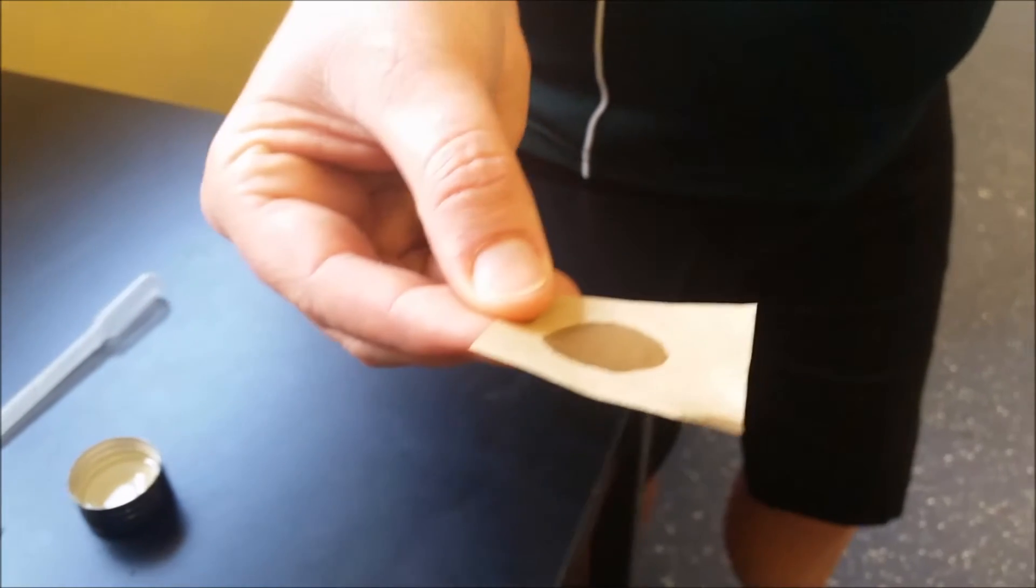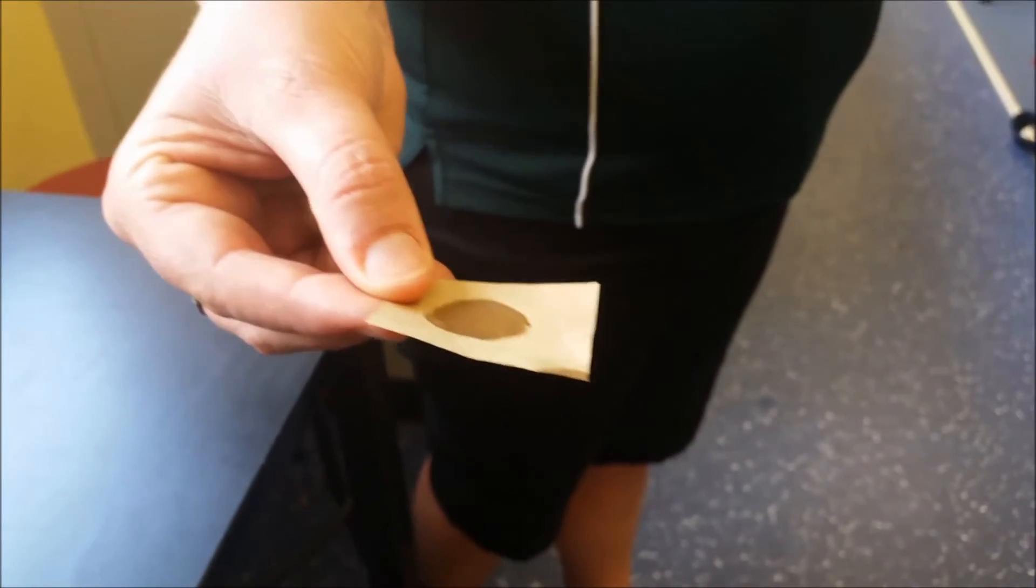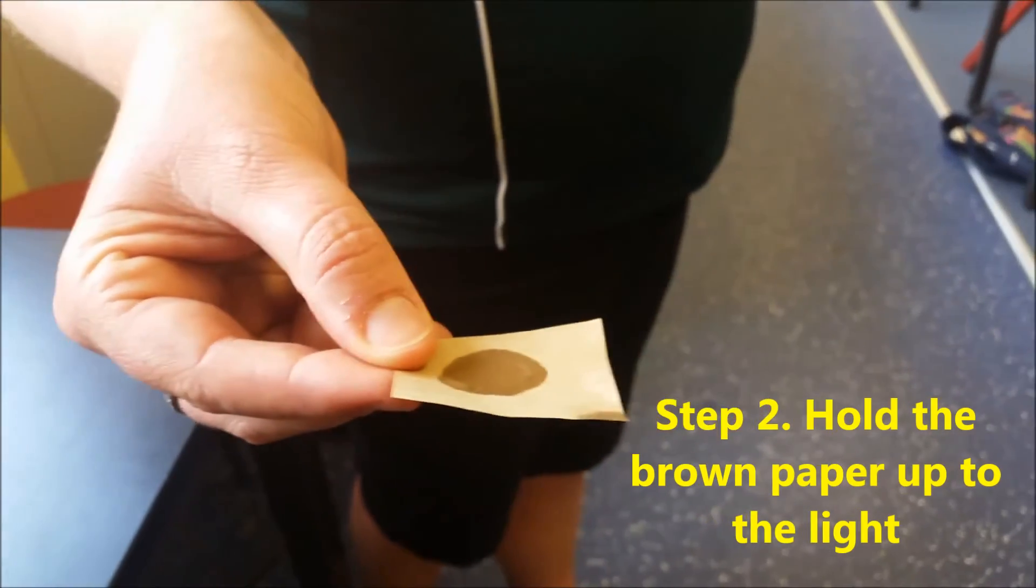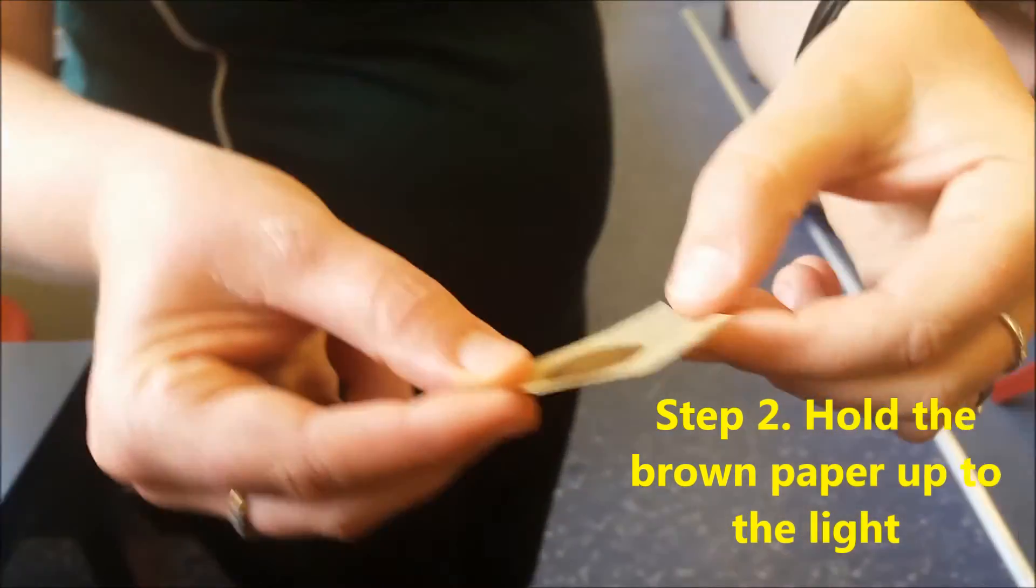Either way, the positive test result, the next thing is to then hold the brown paper up to light, whether that is through the window or your light in the classroom, and you should see a difference.